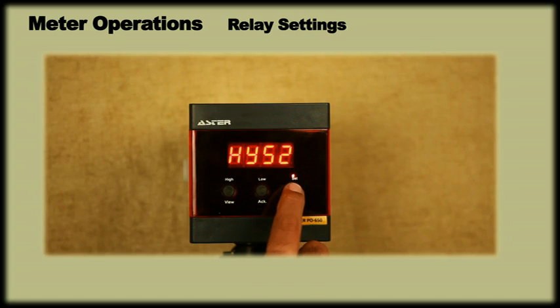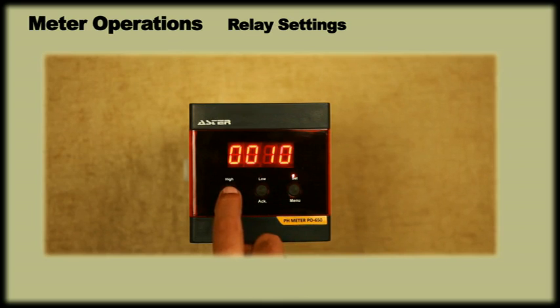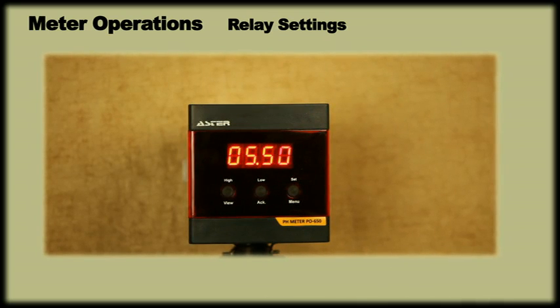Now the display will show hysteresis 2. On pressing menu, it will show a previously set hysteresis value. Using ACK key and view key, we can set the required hysteresis value. Let us set hysteresis value at 10% and press menu to enter. In this case, low set point is 5 with 10% hysteresis. Hence the relay will get reset only when the pH goes over 5.5.